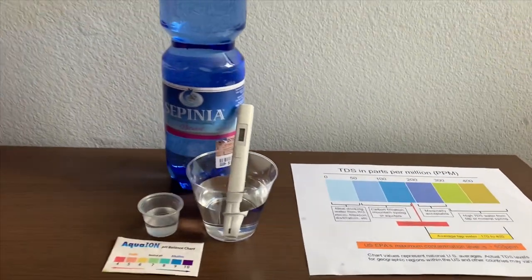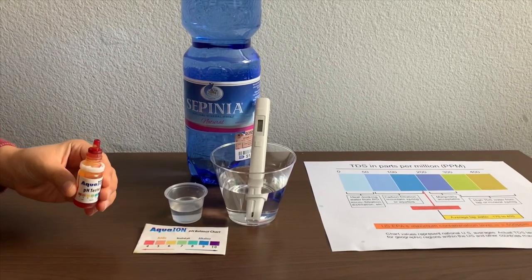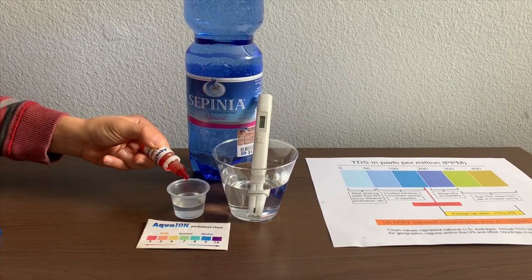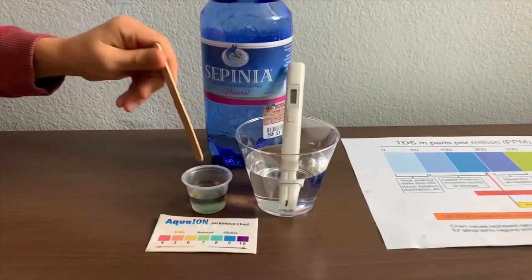Now let's test the pH level. If you want to buy this pH tester, check the link down below. Only do two drops. Let's stir it all for a better result.